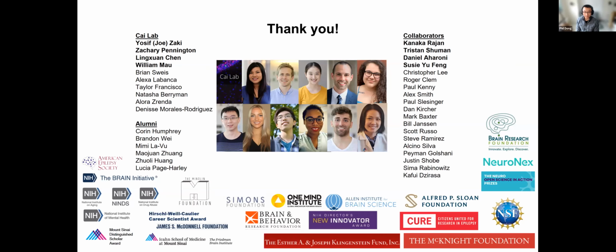Yeah, that sounds definitely true, because a lot of the steps in the pipeline assume a round blob shape of cells. If they're really localized, I assume it will really clean up everything. There's also the high contrast, the C version of GCaMPs, that are somewhat designed for single photon imaging that also could help. Yeah, I would love to see those data.